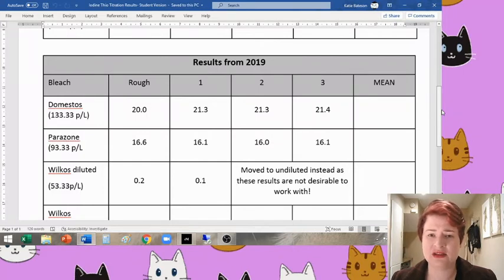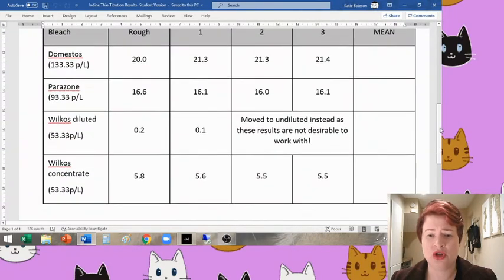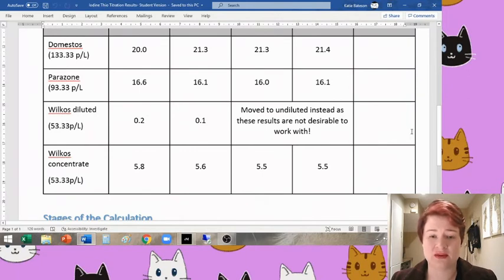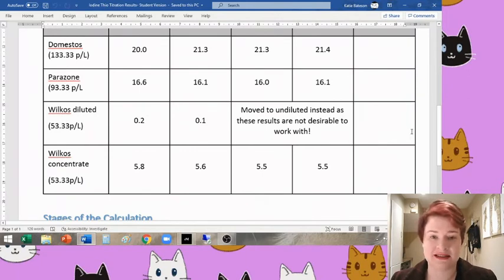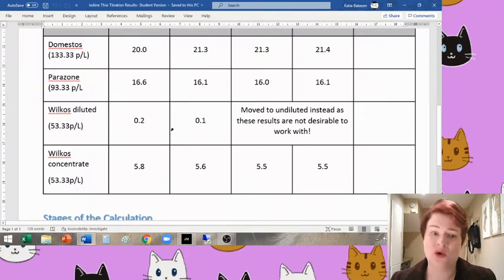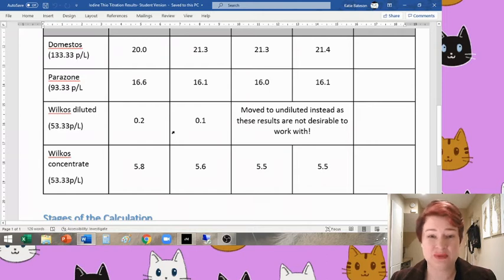The diluted version of the Wilko's own one, we couldn't get accurate titer values for at all. They were changing almost instantaneously. So you can see there the 0.2 of a mil, 0.1 of a mil.